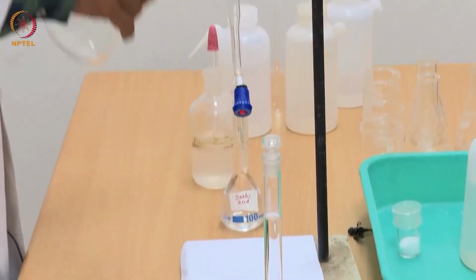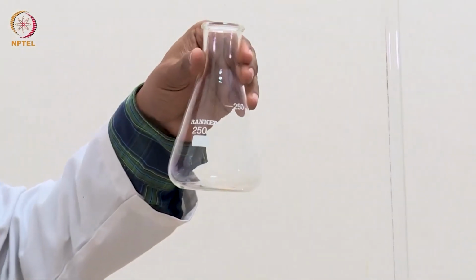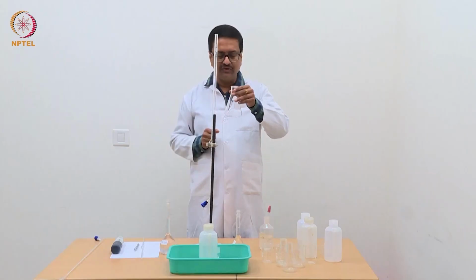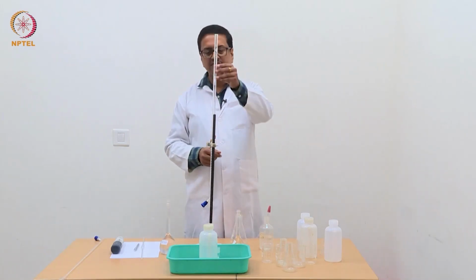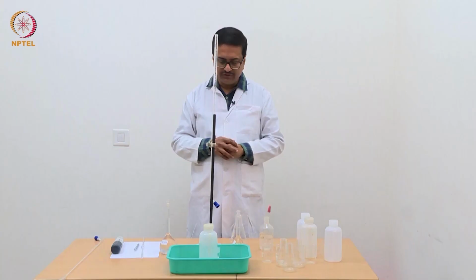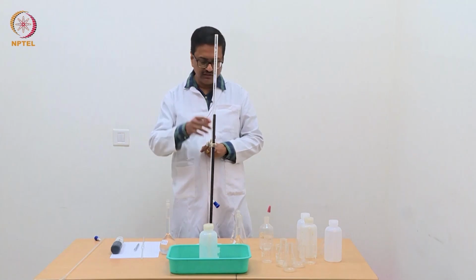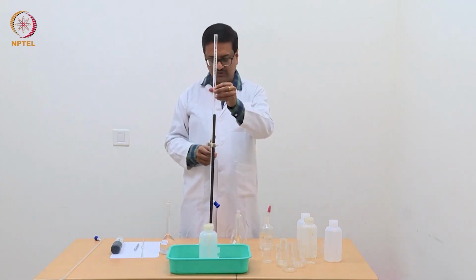So, we will do this standardization using a 250 ml conical flask, where we will pipette out our oxalic acid, and we will use this 50 ml burette which I have already mounted on this stand and clamp. We will use this burette and fill it with sodium hydroxide and do the titration.